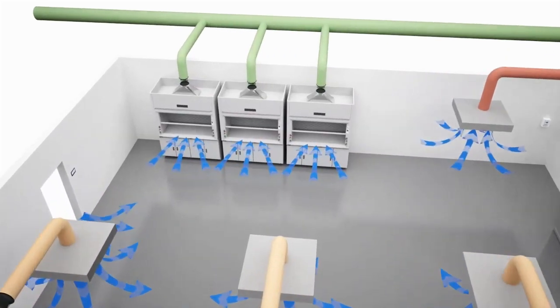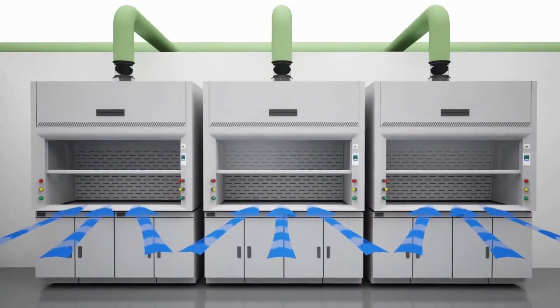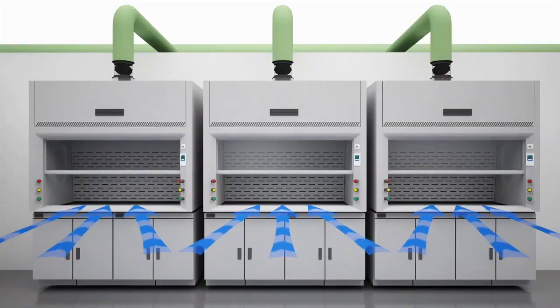The air is drawn from the lab space into the hood to contain contaminants, preventing the risk of escaping into the room.